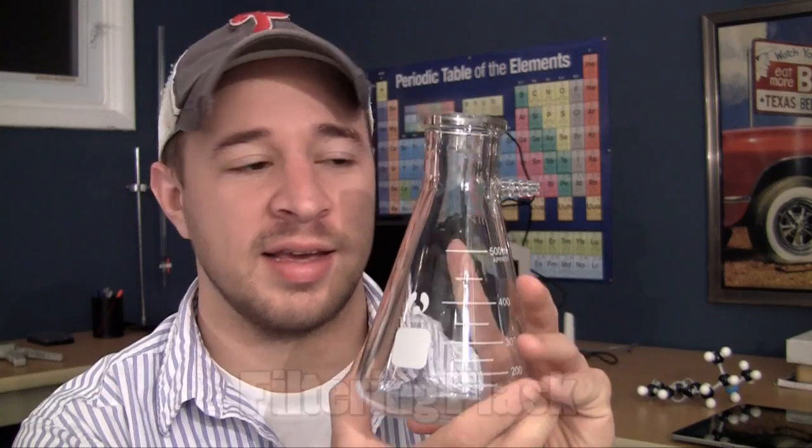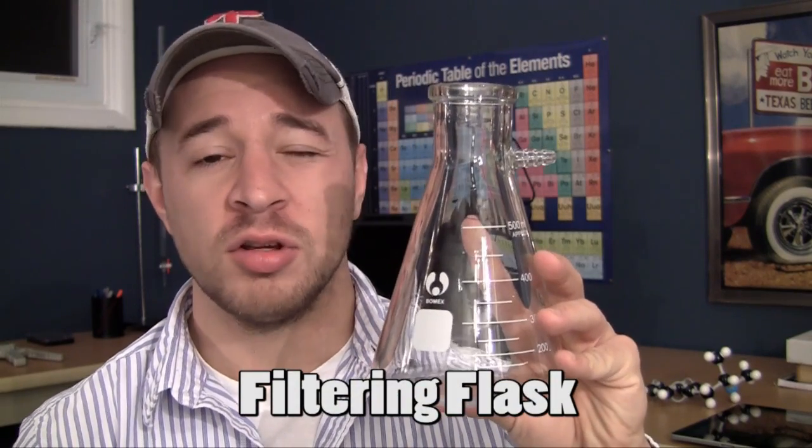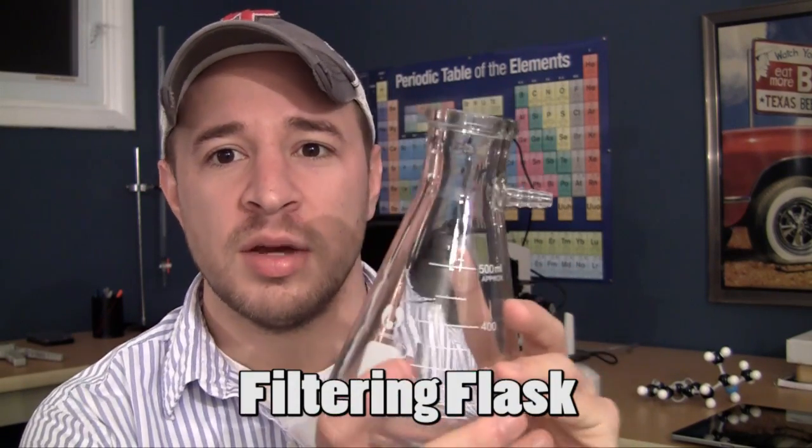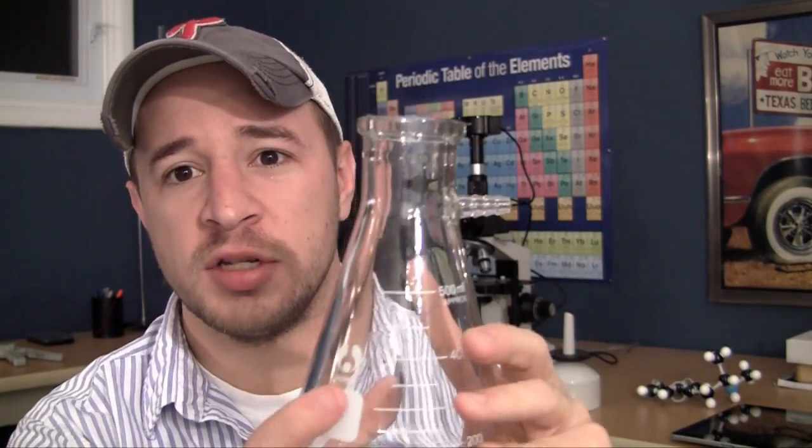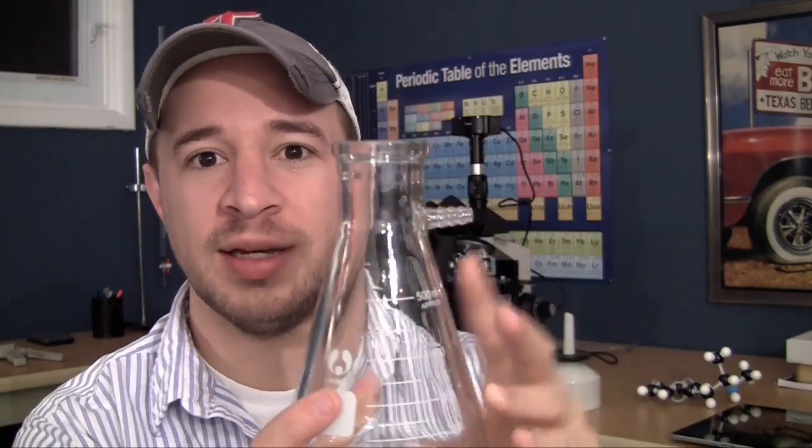What is going on guys, it's Bucky and in this video I want to talk to you guys about the filtering flask. Now a filtering flask looks a lot like an Erlenmeyer flask, but it has a little sidearm on the side right there. Now the sidearm is so you can hook up a vacuum tube to it, and that's pretty much what I'm going to be showing you guys later.